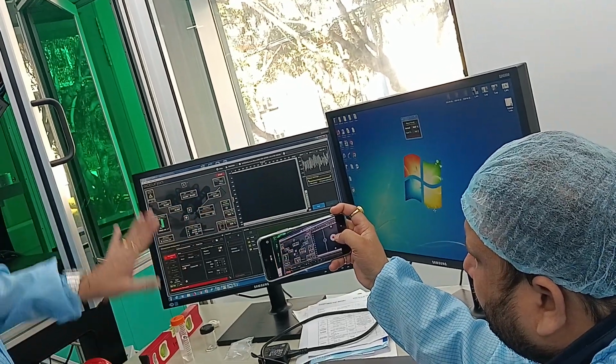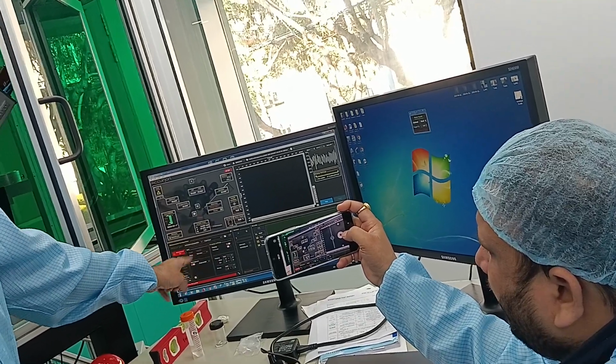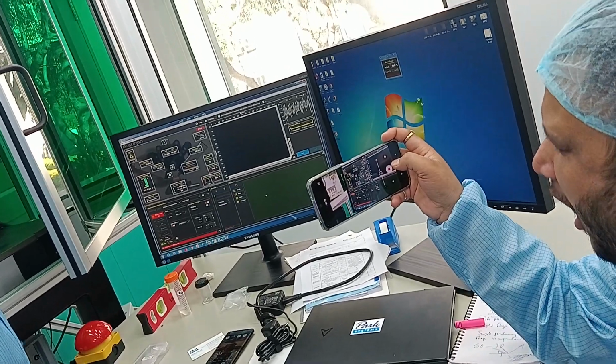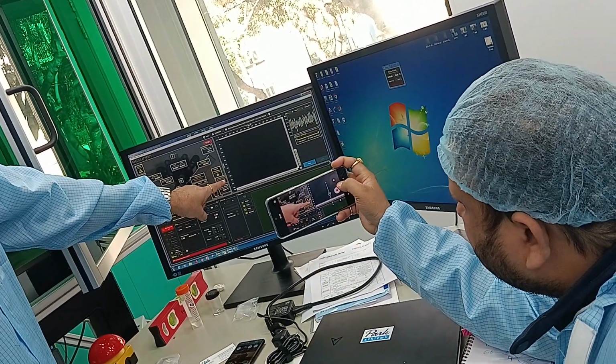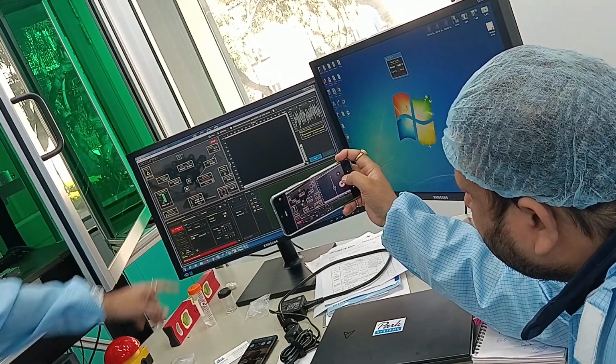Then I have to select my objective. I have not selected the objective, therefore you have a red light. Until I select my objective, it will not show me that. Okay. Models, we have liquid handling, then we have Linkam temperature, this one. So I am not going to do anything, and this is a sample stage.